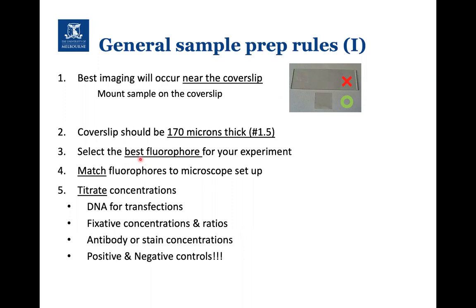Next thing, and again, we touched on this on Tuesday, was to choose the best fluorophore for your experiment. After that, we can try and match those fluorophores to a microscope setup. So obviously, we'll cover this in the confocal section in terms of matching the laser excitation to the fluorophores that you're using in your experiment.